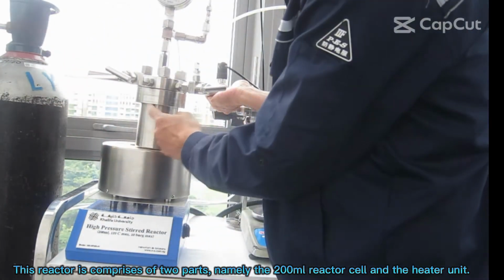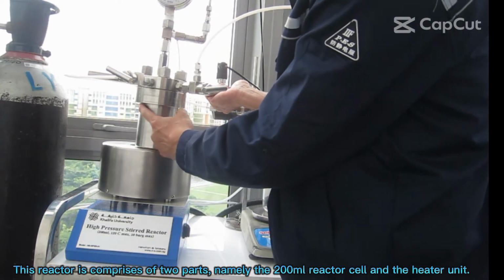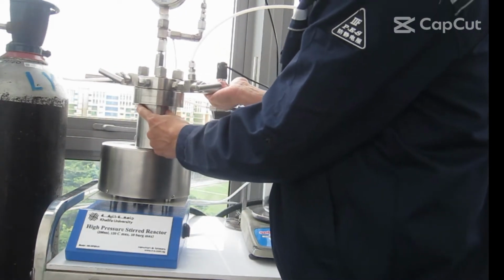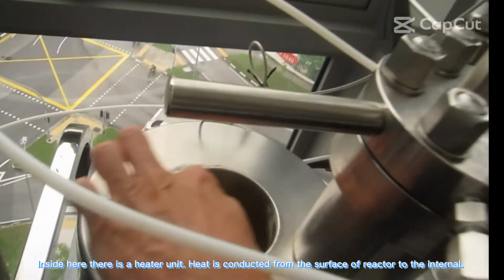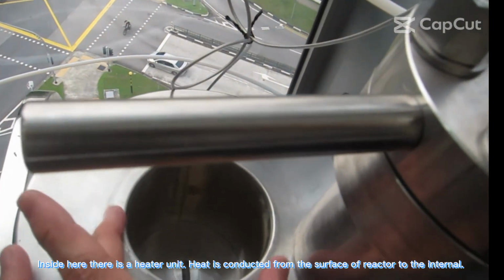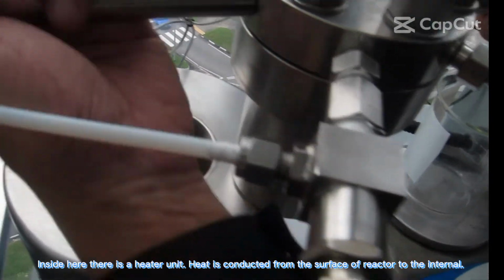This reactor comprises two parts, namely the 200 ml reactor cell and the heater unit. Inside here, there is a heater unit. Heat is conducted from the surface of the reactor to the internal.